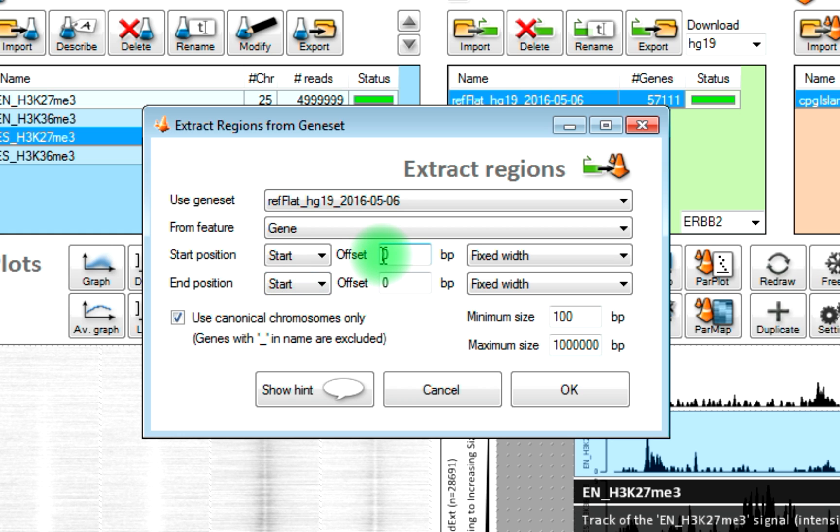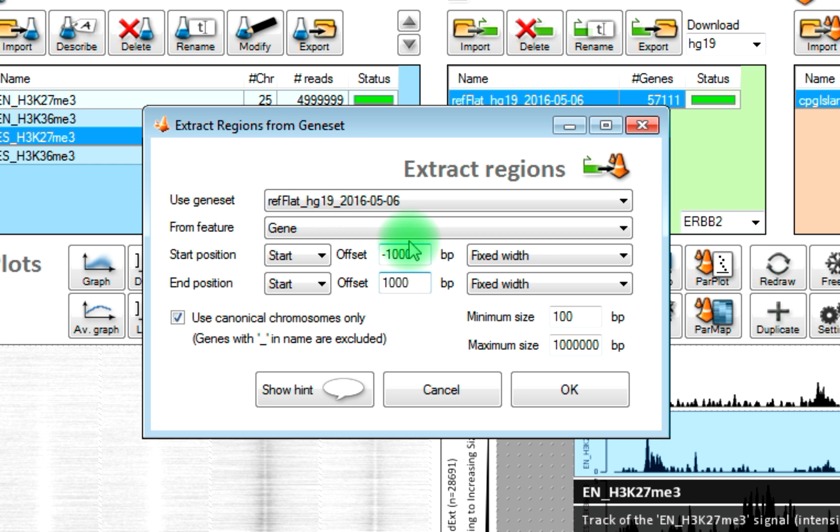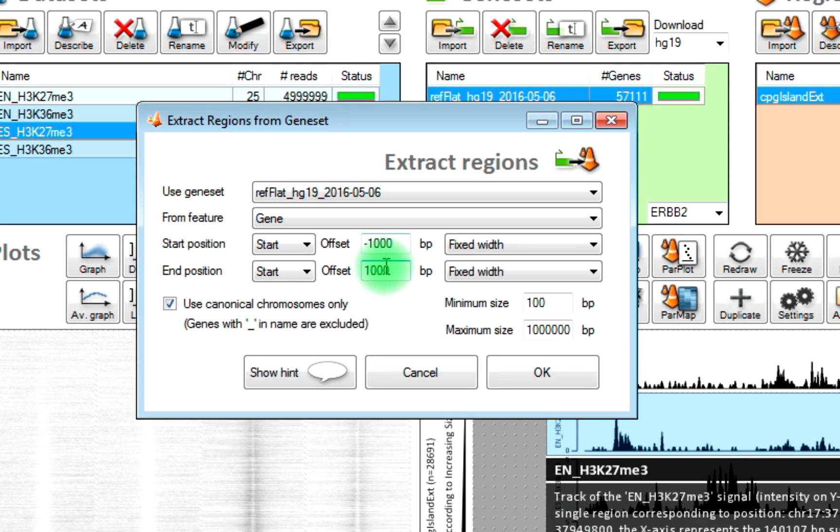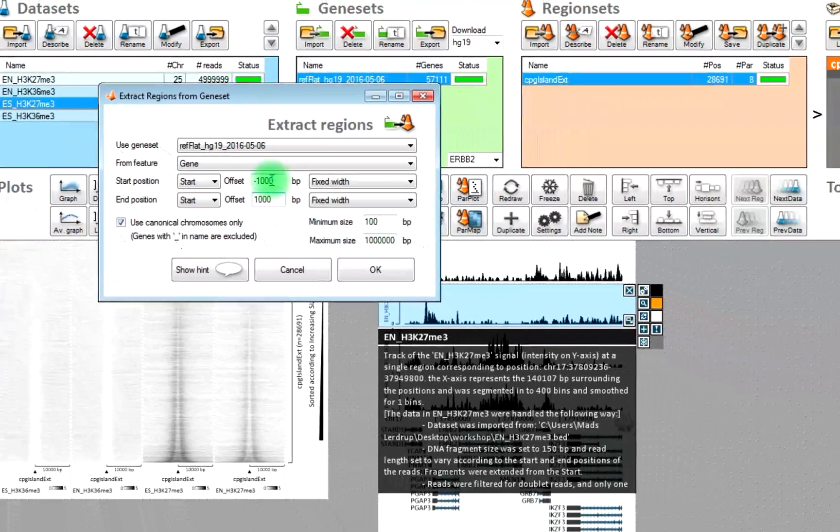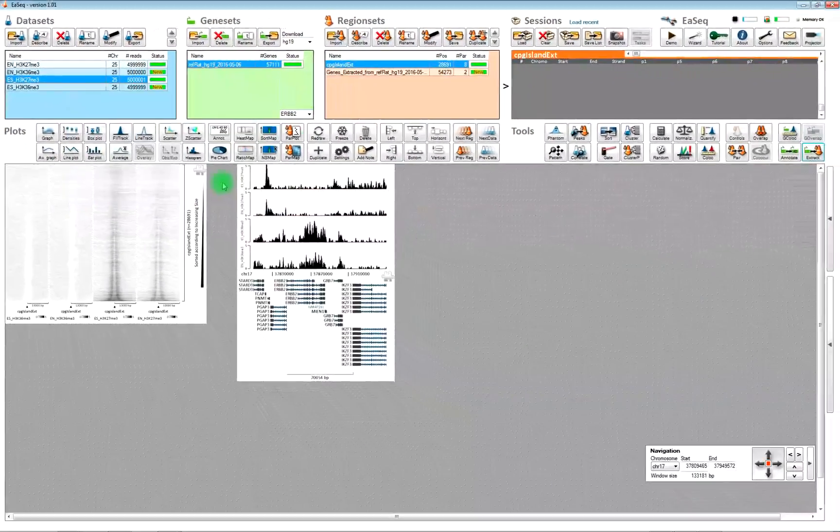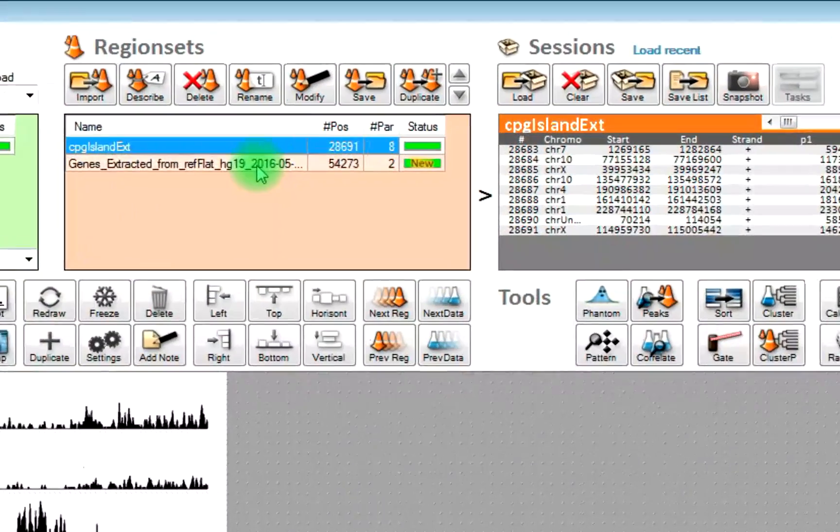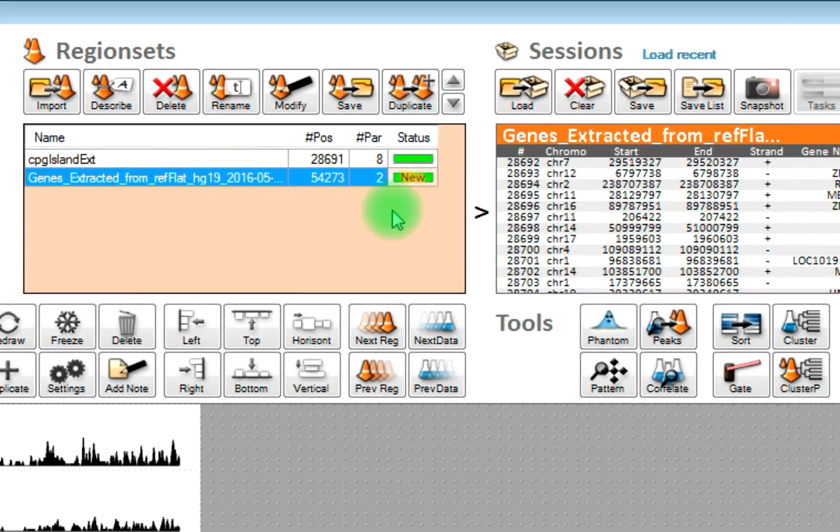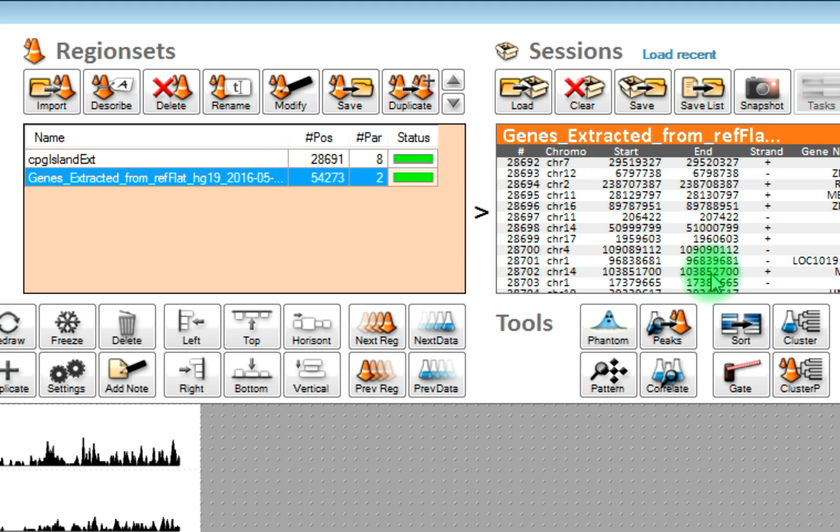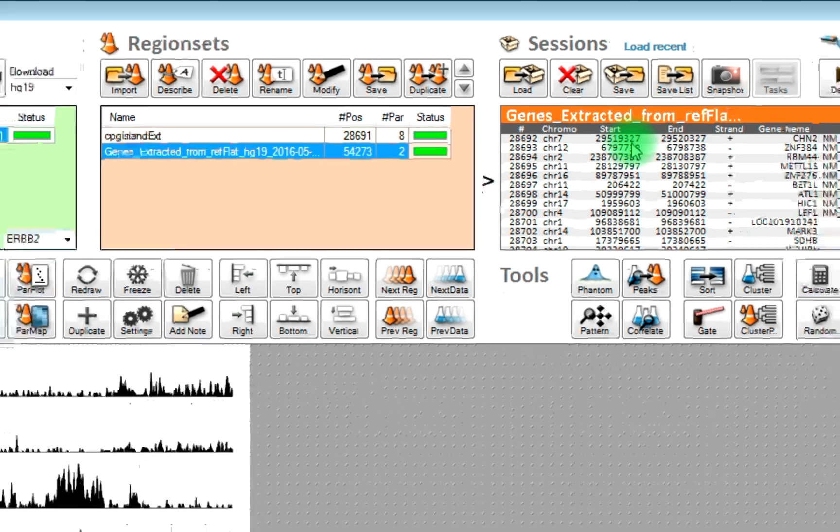We could also introduce an offset. Let's say we wanted to have some regions that correspond to minus 1000 base pairs upstream the TSS to plus 1000 base pairs downstream the TSS. Then we type it here. Click OK. Now we have 54,000 regions corresponding to the transcription start sites or the 2000 base pairs around the transcription start sites.